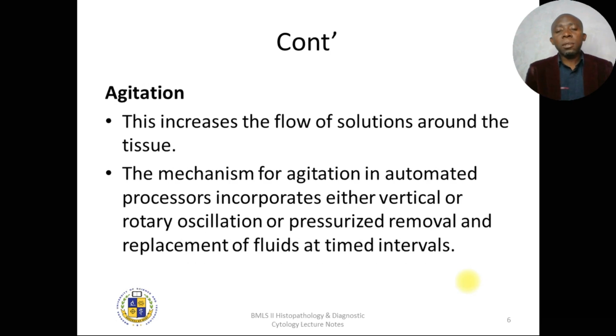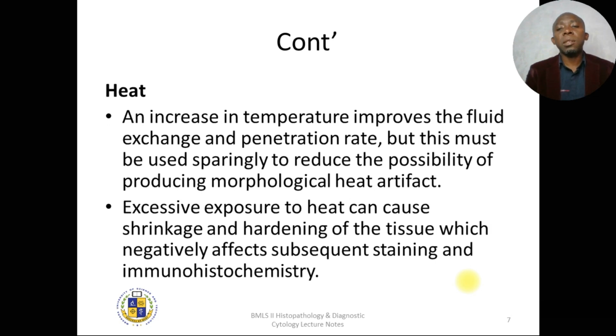Moving forward, another factor we looked at when we talked about fixation was agitation. Agitation increases the flow of solutions around the tissue, and in that way also increases the rate at which molecules penetrate the tissue. We also talked about heat in that presentation.